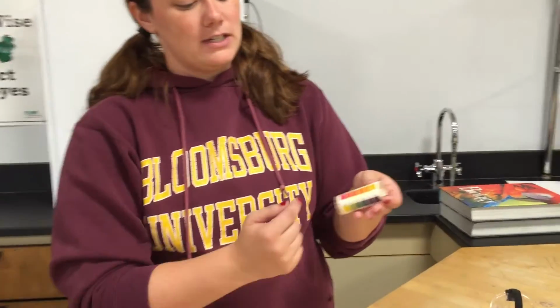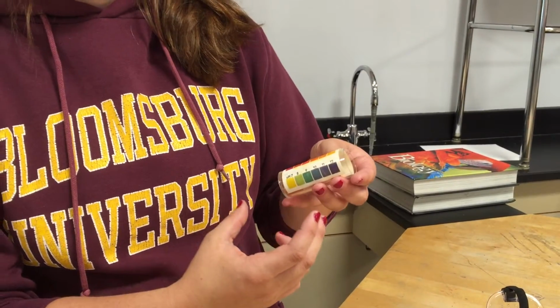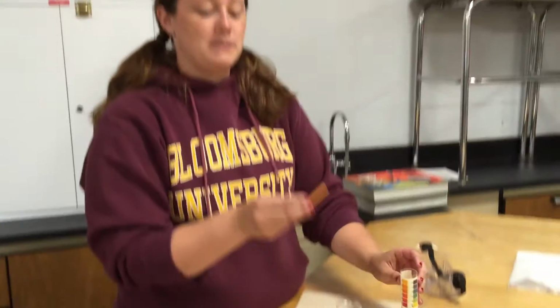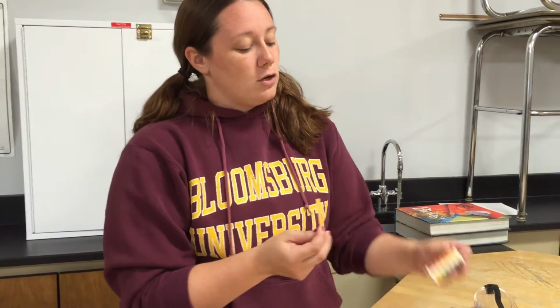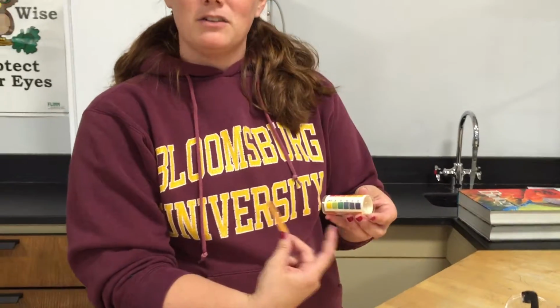You're going to need a tube of pH papers, and you can see that there's a scale on it. And we're going to use the paper as an indicator for us. The paper comes in these little strips, and it's going to change colors when it comes into contact with a liquid because of a chemical reaction. That's how we get the indicator to be able to tell us what the pH is. And so you're going to be able to then compare the color of the paper to the colors on the bottle to determine the pH.